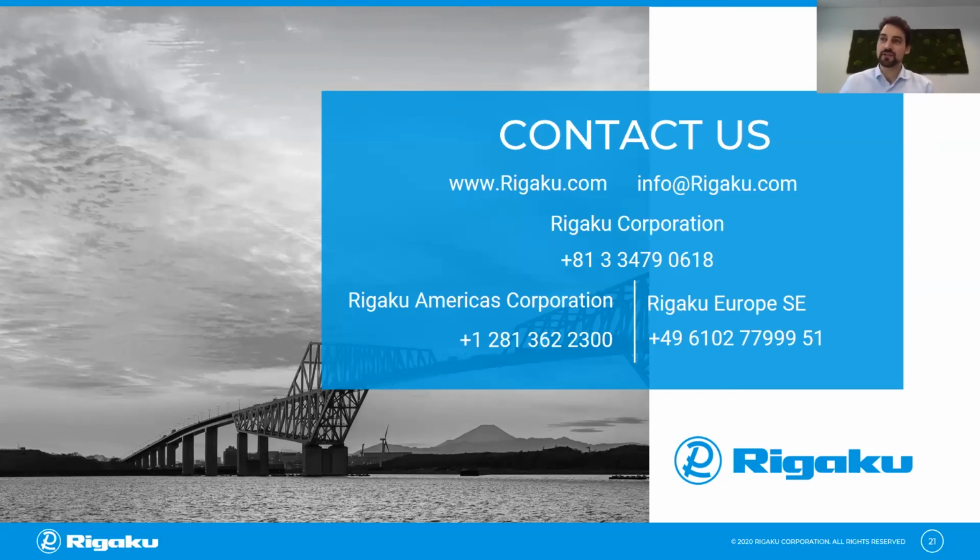And the next question is, are other crystalline sponges available? So apart from changing the anion, can you also change other things in your sponge? Oh, yes, sure. This webinar was about the classic Fujita sponges. Of course, there are also other metal organic frameworks that can be soaked with analyte molecules.